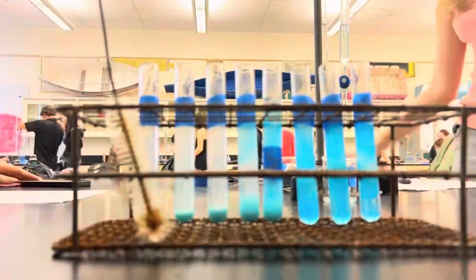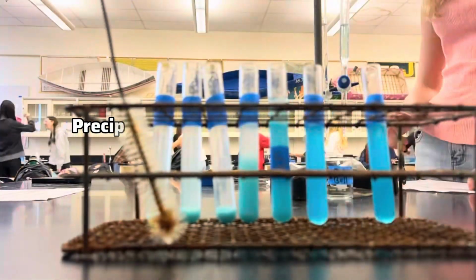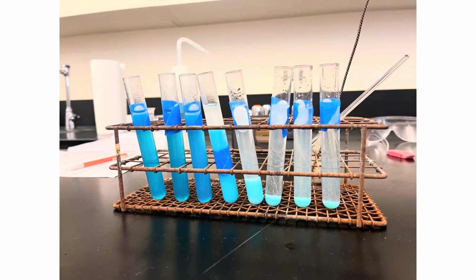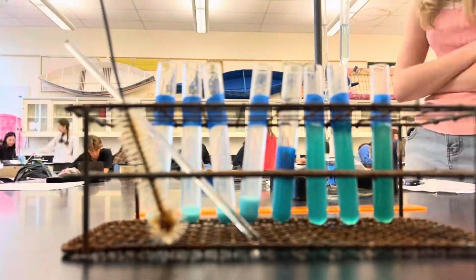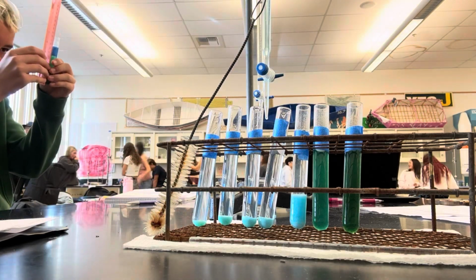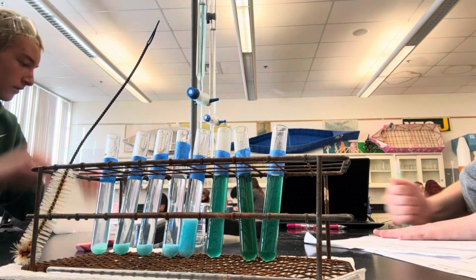Continuing to stir the solutions to ensure proper results, we finally let the precipitate, a solid that emerges from a liquid solution within a chemical reaction, fully settle alongside the supernatant, the liquid above the precipitate. The precipitate was a light blue in all test tubes at first, but the longer it sat, the darker blue and more oxidized it became in test tubes 5 through 8, eventually becoming an almost black blue-green. Furthermore, the precipitate was initially suspended in the supernatant, having a chunky, jelly-like appearance until we further stirred it.